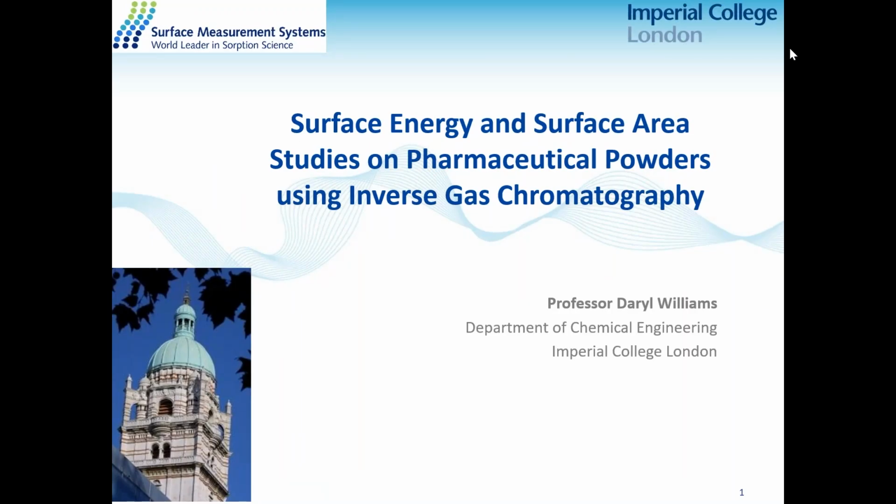So the first technique I'm going to talk to you about today is called inverse gas chromatography. Don't worry if you haven't heard about it. It's still a technique that not everybody knows about. But if you're interested in surface properties of materials, particularly pharmaceutical materials, this can be a very valuable technique. It can give you information about the behavior of materials, and particularly the surface energy, which we don't often hear talked about in many areas of particle science and powder engineering. I'll explain all that during today's presentation.